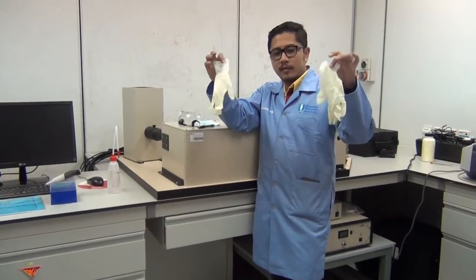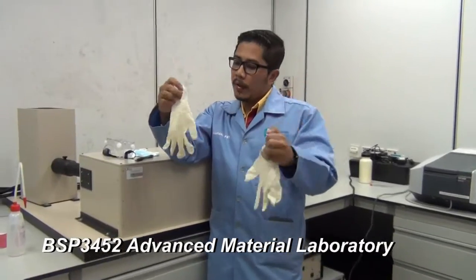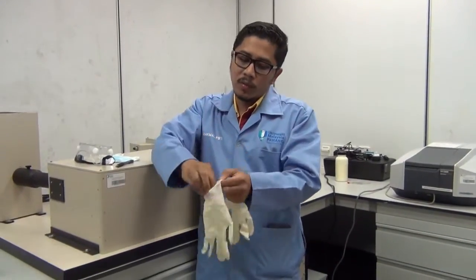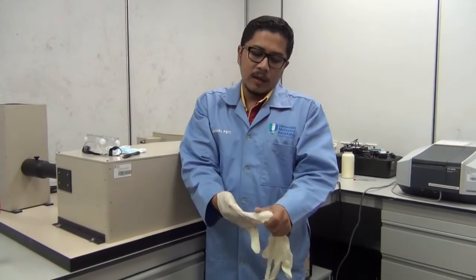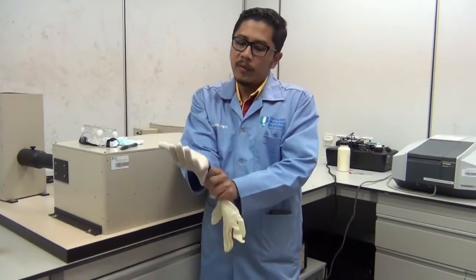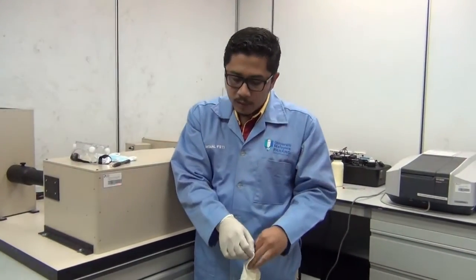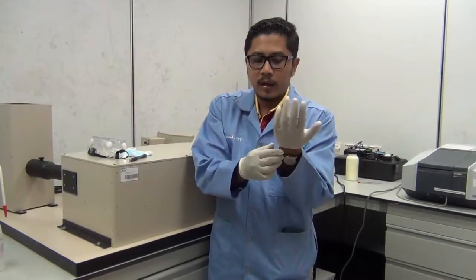What are these? Sotong kering? No, these are gloves. So make sure that whenever you are going to play around with chemicals or powder, you need to wear gloves all the time for your own safety. We don't know the nature of the powder. Could be harmful or could be toxic. So even though you know that it is not toxic, it is always a precaution to wear gloves.